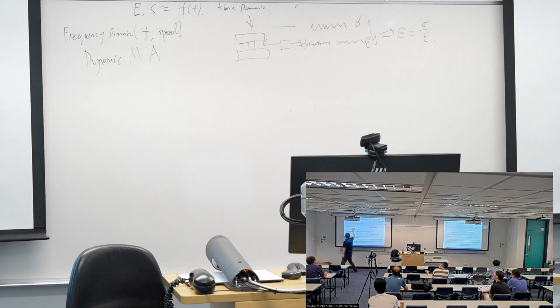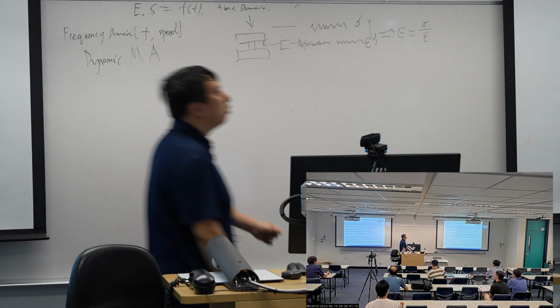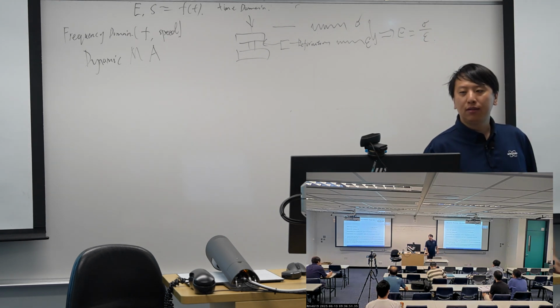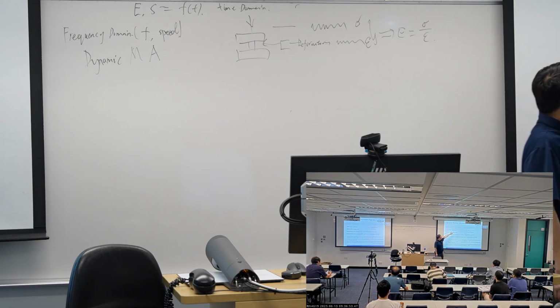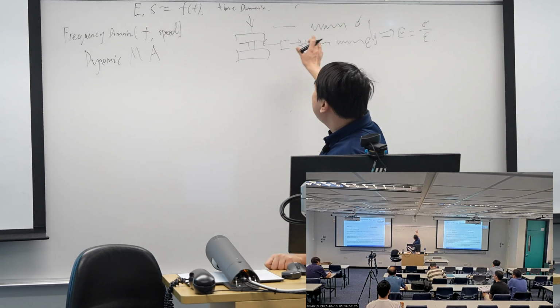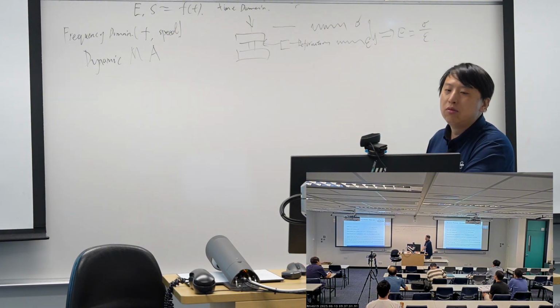Now, we do not apply a constant stress or a constant strain. We just give it a periodical wave. And the simplest periodical wave we can define is a sine wave. So we just give our stress, give our force, in a sine wave way.